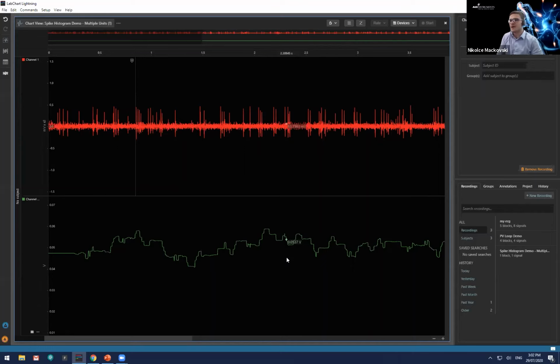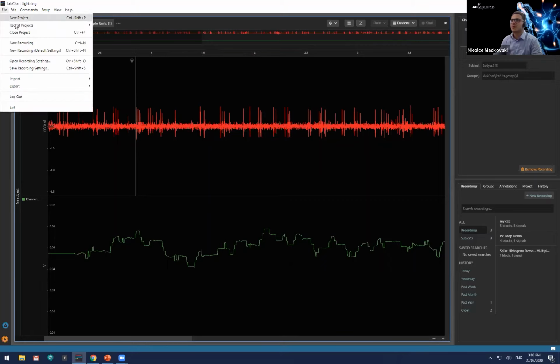The custom calculations feature is in many ways replacing quite a few parts of modules within LabChart 8. This way we can give the user more freedom and flexibility to create their own calculation and then send it to their colleagues, and they can critique it and how it works. Because we want to break those shackles of sometimes the modules being too strict for what they can actually provide, and then we want some more. The custom calculations feature can provide that, and this is something that we're constantly updating and improving in our research here.